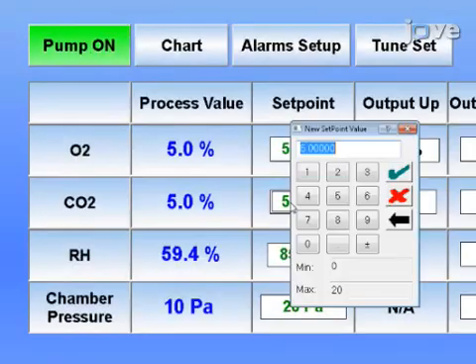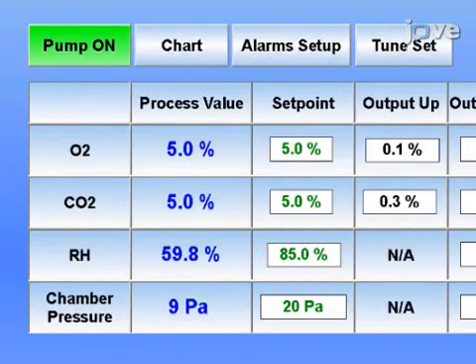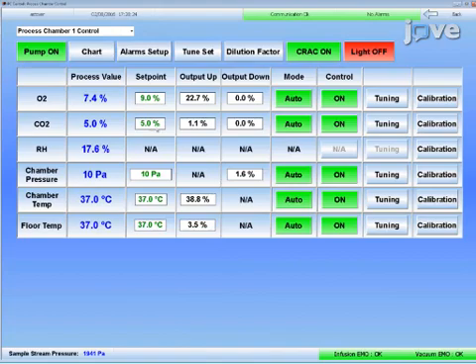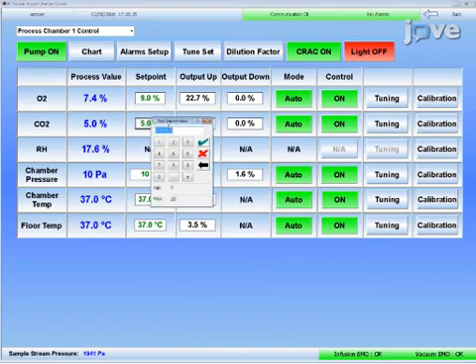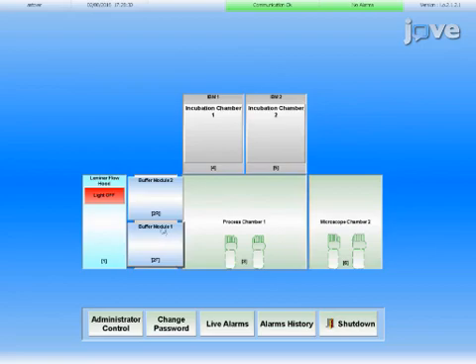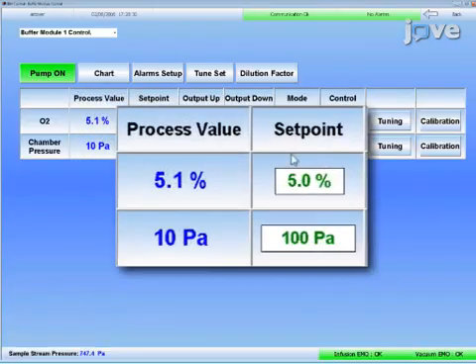Repeat this step for carbon dioxide and enter a setpoint of 5% carbon dioxide for all modules, except for the buffer chambers, which are only adjustable for oxygen. Then, monitor the current gas concentrations, which are labeled as process values, to make sure that they reach the new setpoints.